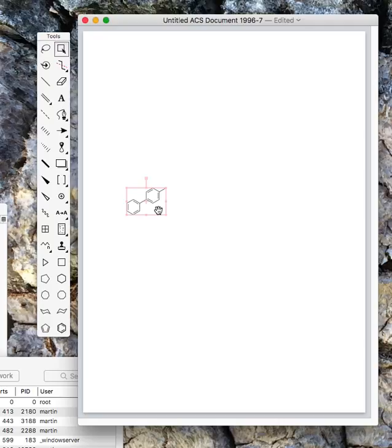So while this is highlighted, I'm going to use Command right arrow to create a simple scheme, then the Command down arrow to create a second scheme, and the Command left arrow to complete the circle, and all of the new elements are all beautifully aligned.